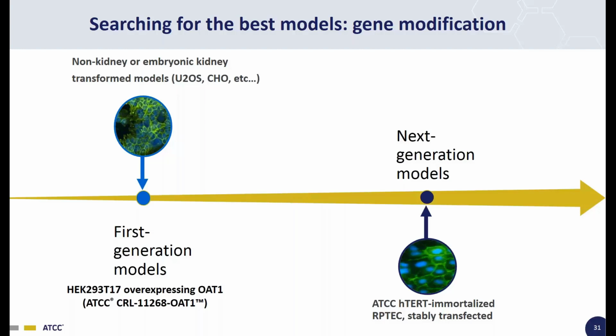To address this and develop more physiologically relevant next generation renal models, my lab started with an immortalized proximal tubular cell line and then stably integrated SLC transporters into this cell line. I'm now going to walk you through the generation and the application of these cell lines.